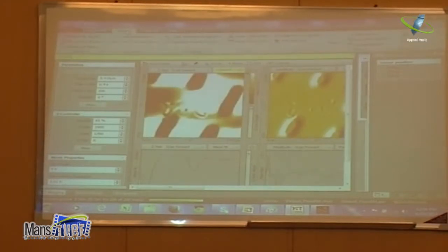I mean, I have to make analysis. If we are following the same fit, okay. If it made the same.